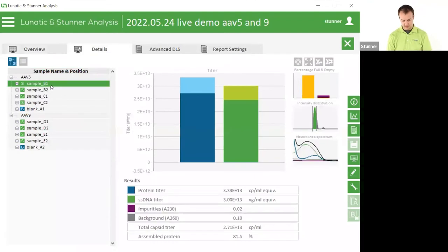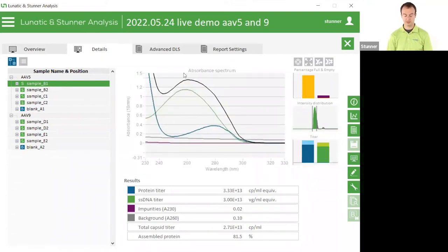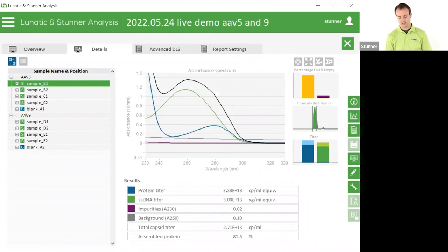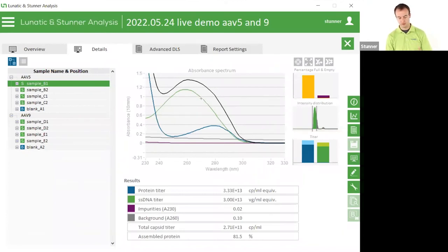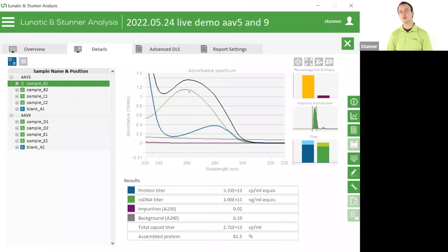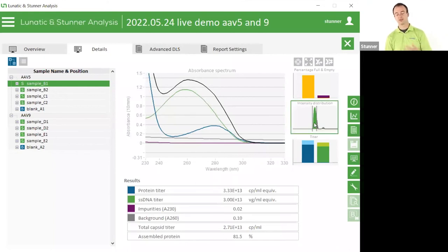If we want to dive into the details on the sample, we can look at sample B1 and take you through each of the three detection technologies one by one. Starting with UV-Vis - with a normal UV-Vis instrument, all you're going to get will be this black line, that's the total UV-Vis absorbance. But because Stunner is a really smart piece of software, it's able to deconvolute or break down that black line into its component pieces that you told Stunner what was in there. In this case we told Stunner this is an AAV5 sample with about a 2.5 kilobase payload, so it's breaking down that signal into green, which is DNA, and blue, which is protein. Gray is turbidity, and purple is going to be contaminants that are in your sample. So from this read we're getting an answer on how much total DNA and protein is present in our sample - that's what we'll actually use to calculate the empty-full ratio.